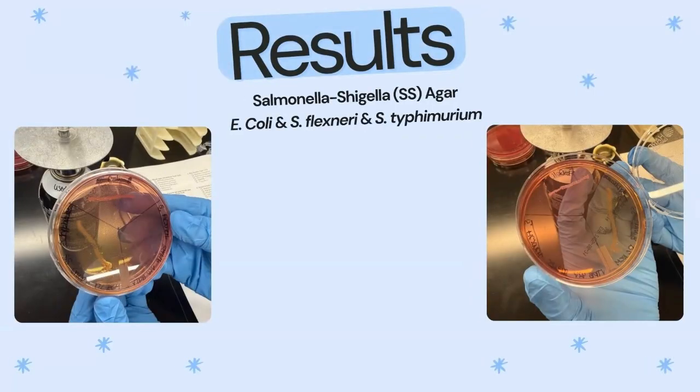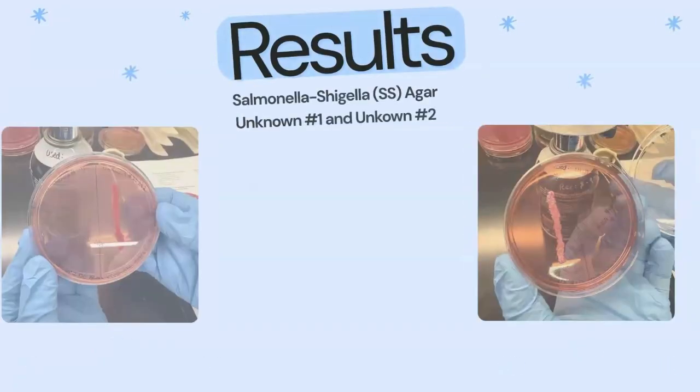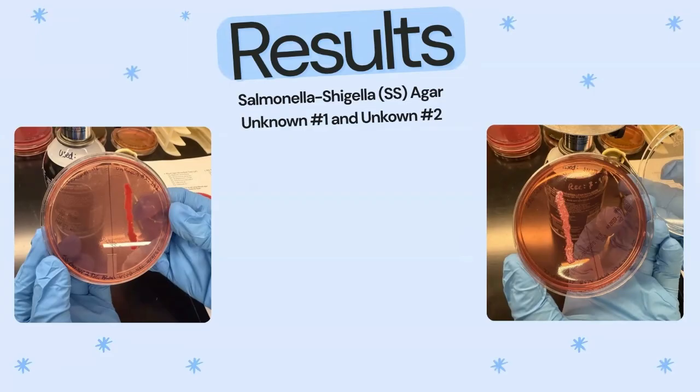Salmonella and Shigella plates are selective for those 2 and detect H2S production. The E. coli and the S. typhimurium did grow, however the S. flexneri did not, and they appear pink as well as colorless. Our unknown number 1 and number 2, the unknown number 2 did grow, but the unknown number 1 did not.